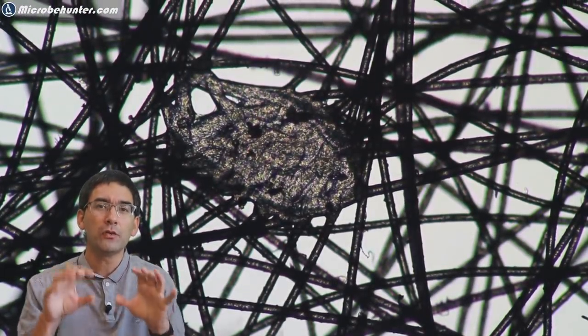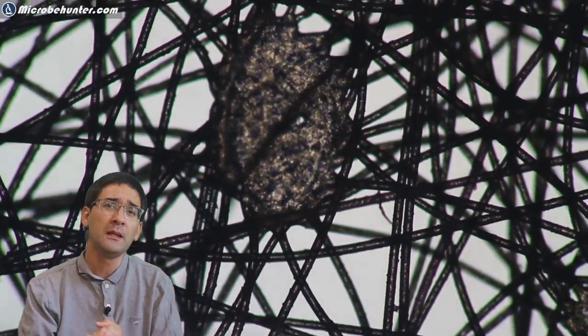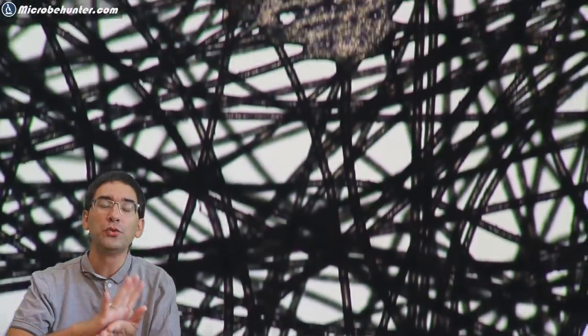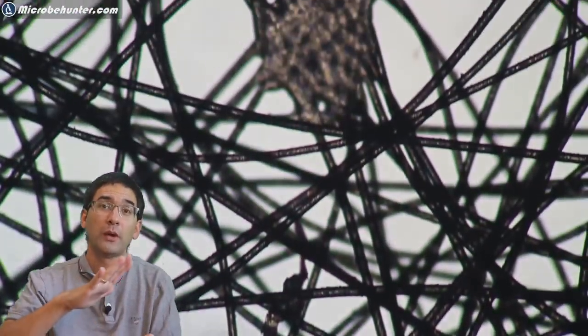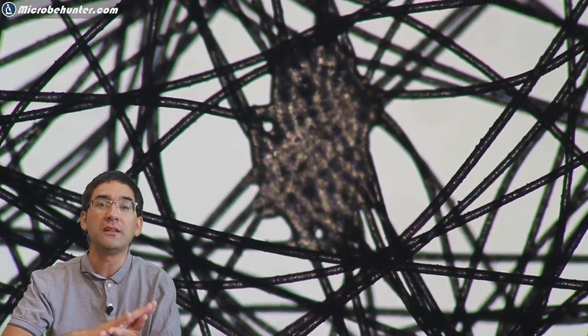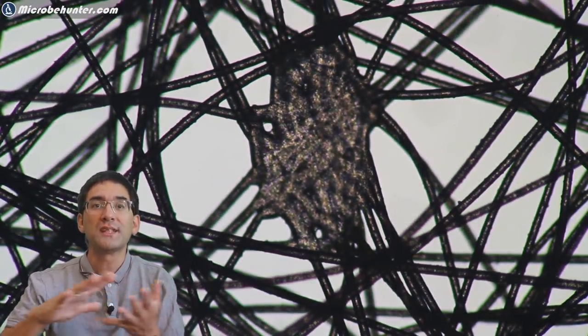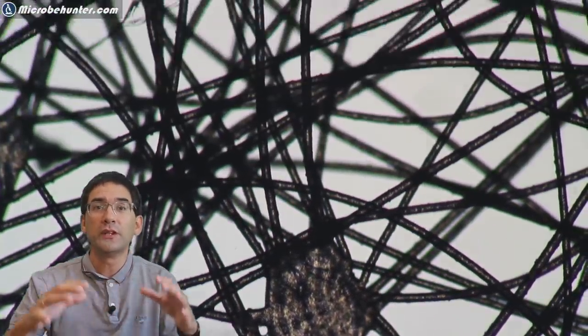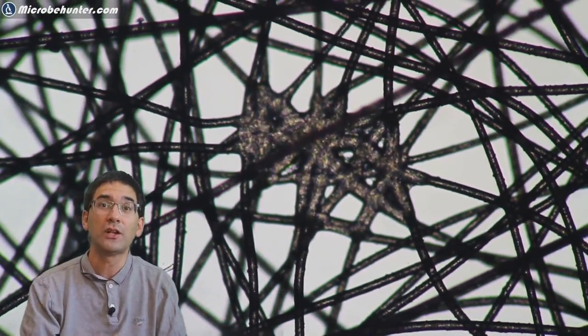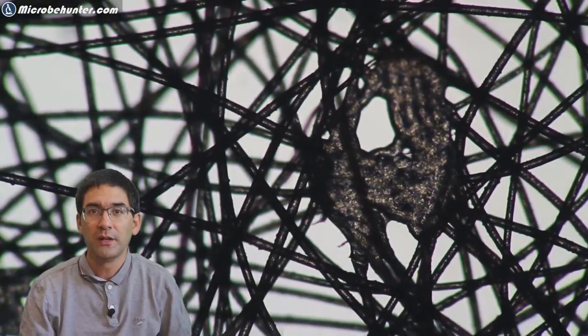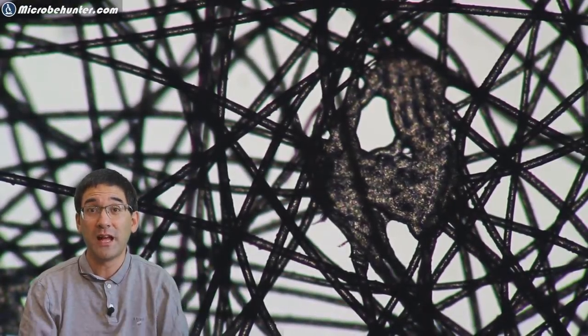This is what I saw at low magnification using the 4x objective. I immediately saw something I did not really expect. At very regular intervals I saw those patches, those round patches, and these are places where the fibers were actually fused together. I suppose that they were fused together using heat so that the individual fibers do not separate. This was a very regular pattern, which is yet another indicator that we're not talking about cotton, which is cellulose, but some kind of synthetic material.